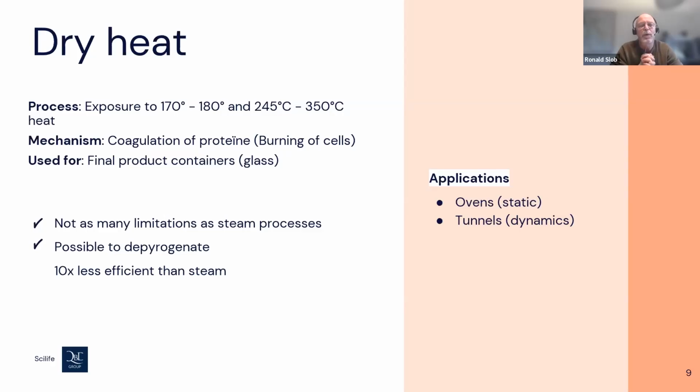And the higher temperature, the depyrogenation, is needed because when you are destroying the cell itself, on the cell there are some lipids, some fats, which are still there, which are not killed, but can still cause a fever. So in the old days, people thought they had it: yeah, we can sterilize, and it's not a problem.